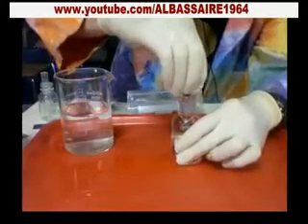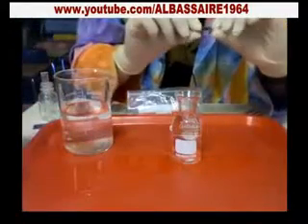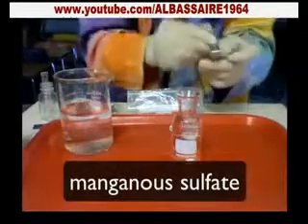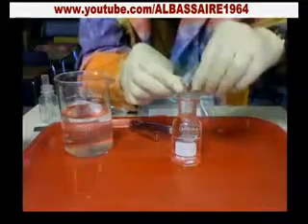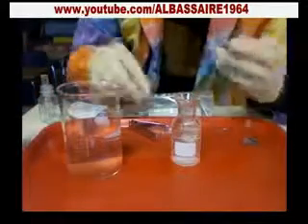Okay, next I'm going to add my chemicals. There are two packets that I'm adding. The first one is dissolved oxygen packet number 1, and that is actually manganese sulfate. I'm going to use my clippers to open that up and pour some in. There we go.